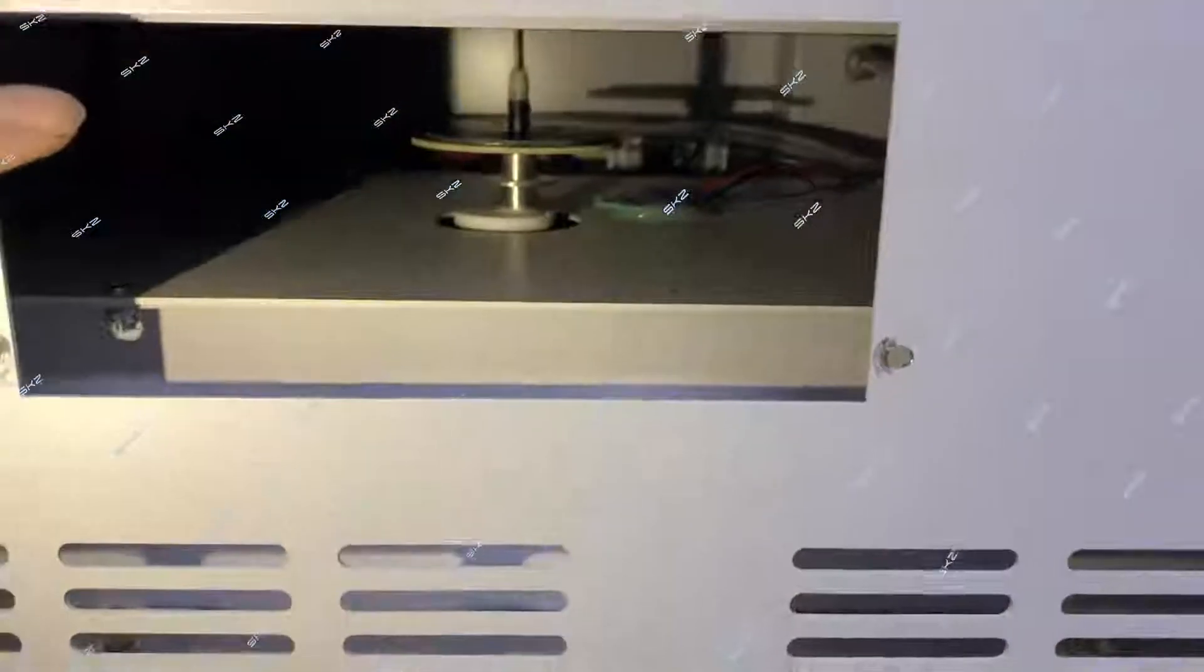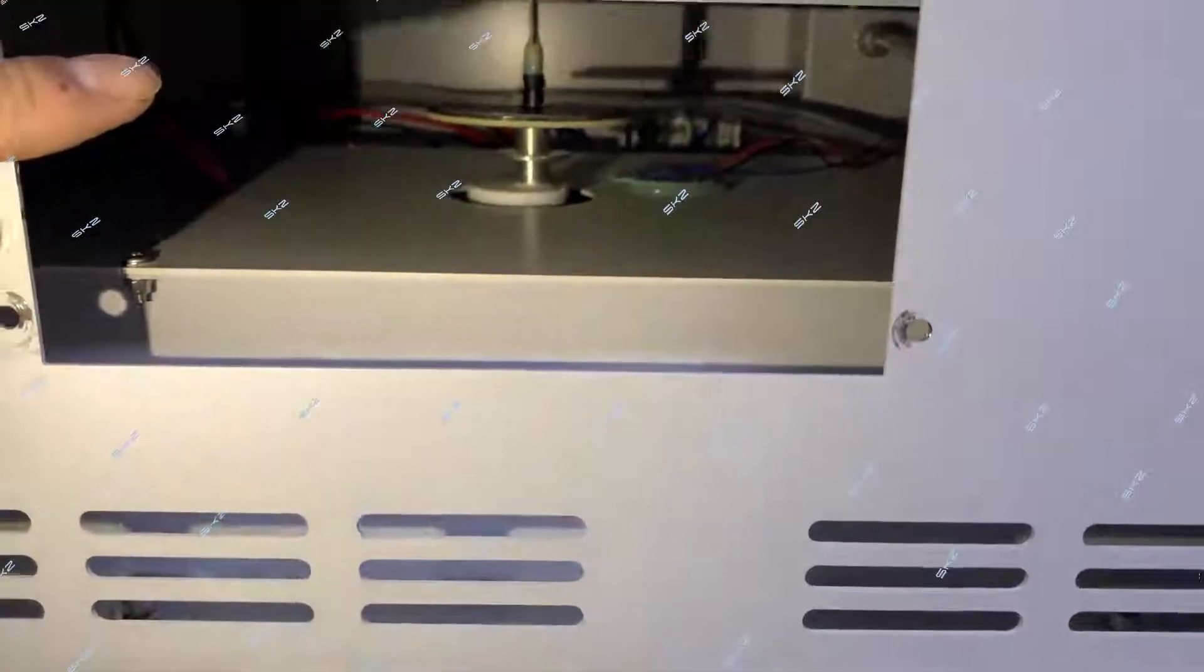You see now the sensor is already fixed. The black mark is against this operation window.